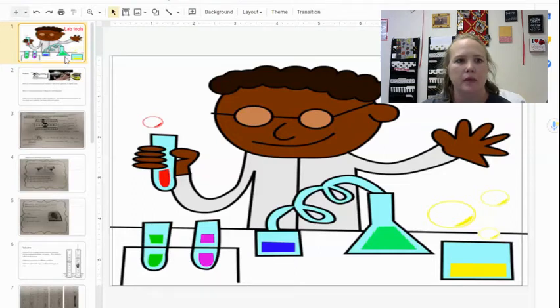All right. I'm going to walk you through how you're going to do this lab tools review. This is just looking at lab tools again. I want to make sure that you have plenty of practice using them. I know you're not getting to actually get your hands on some of them, but I want you to see pictures of them and understand what they're used for. I tried to cover every bit of information I could think of that might be confusing or that you'll need to know.